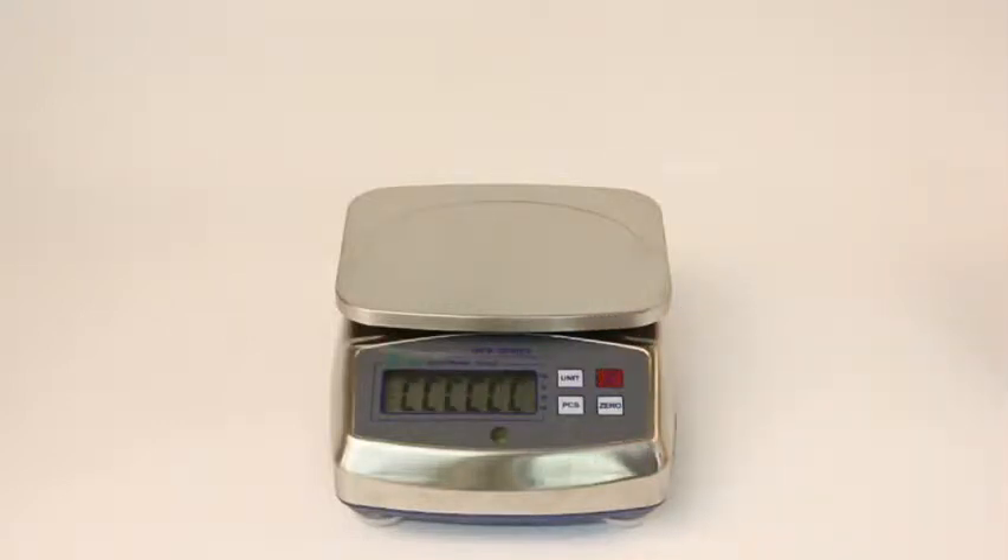This is the WPB series. It is a wash down scale particularly suited for use in the food and chemical industries. It is IP65 certified and fully hosed down.